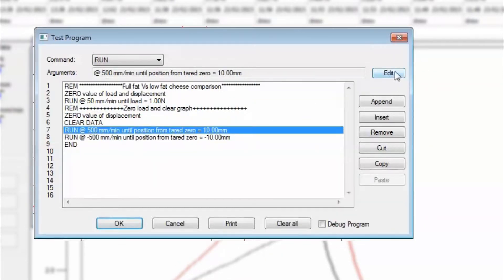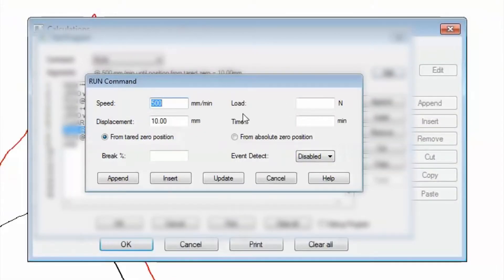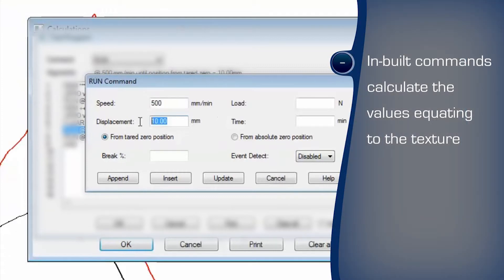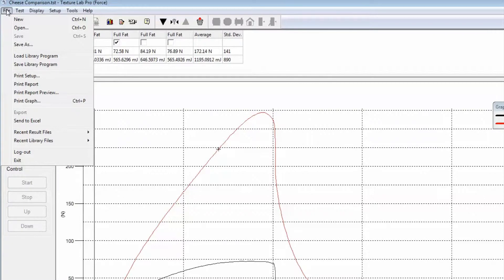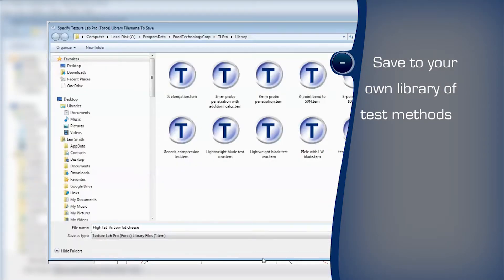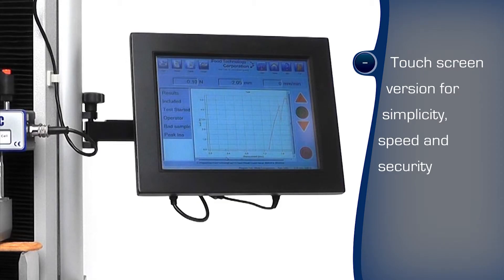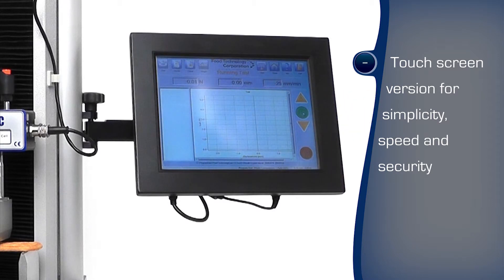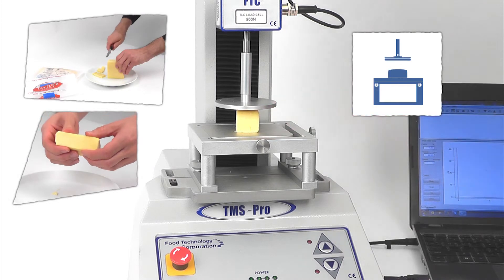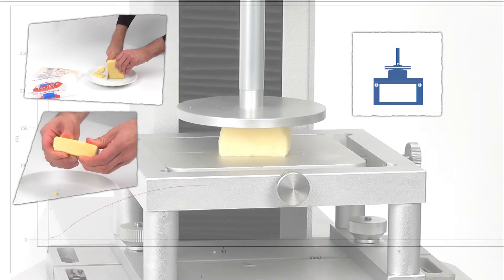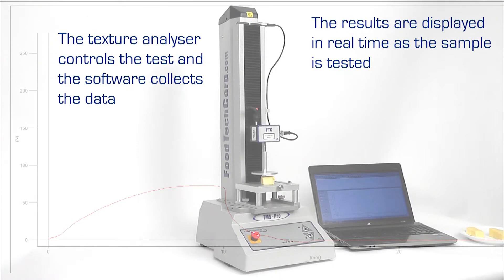The automated test program is easily written with the familiar Windows-based environment. Commands are selected to perform the steps. The cheese's firmness is calculated from the peak force. Additionally, the work required to deform the sample is calculated from the area below the force-distance curve. These two values give greater information about the texture to more closely compare the samples and provide even more feedback about the effectiveness of the formulation changes. The program can be saved in a library and recalled for reuse.